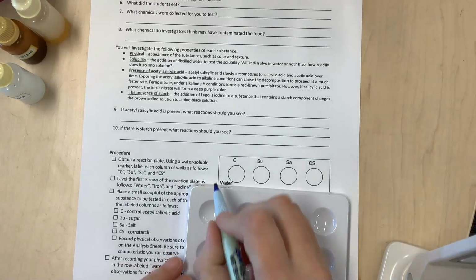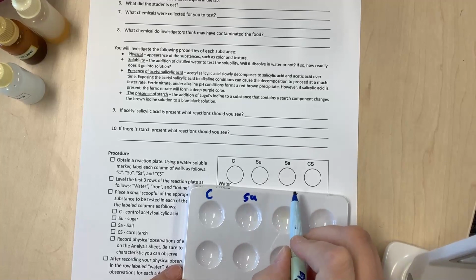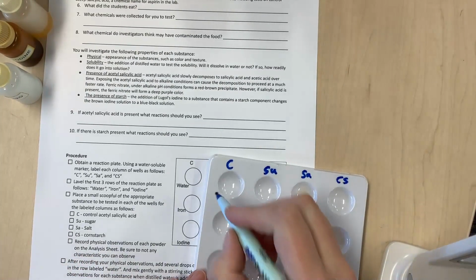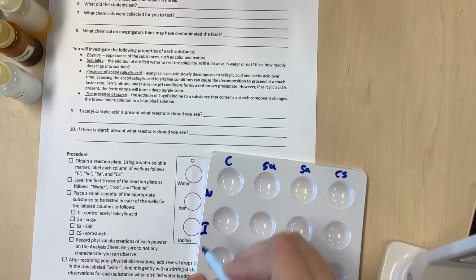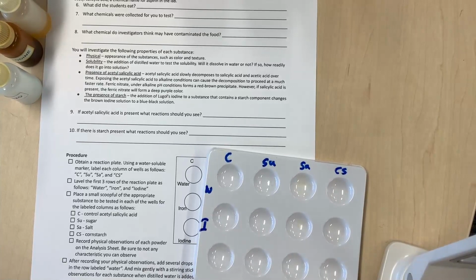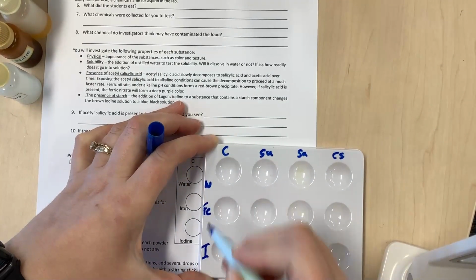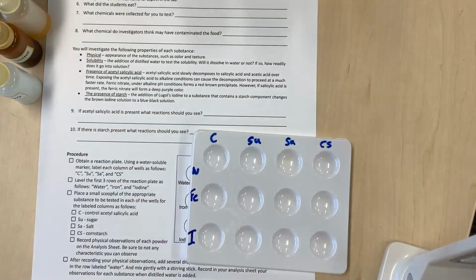There's my tray, and I'm going to label it, and notice I'm using a vis-a-vis water-soluble pen. And I'm being careful not to put the ink into the wells because that will contaminate your samples. So water, iodine, and iron. Actually, hold on. Get that off. The symbol for iodine is I, but for iron, it's Fe, so I'm just going to use that. There we go. So now I know what's going across and what's going in each thing.